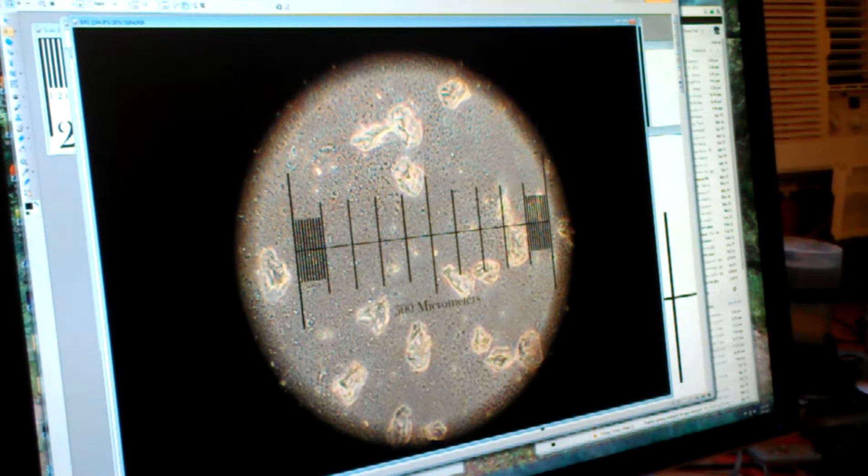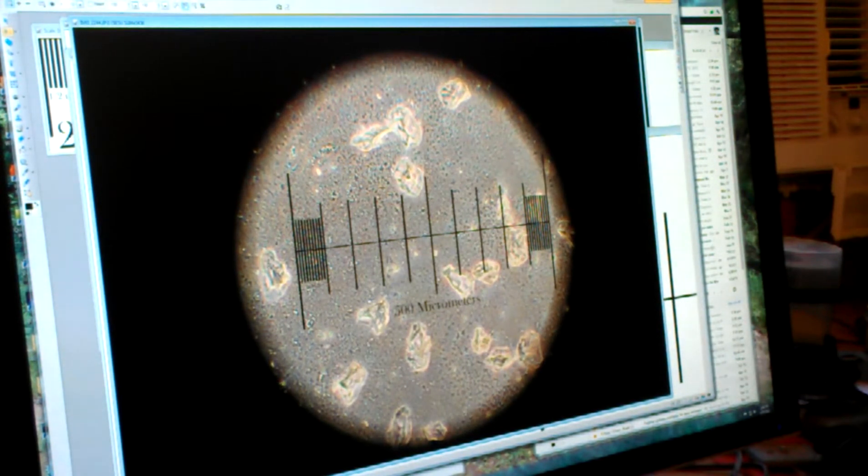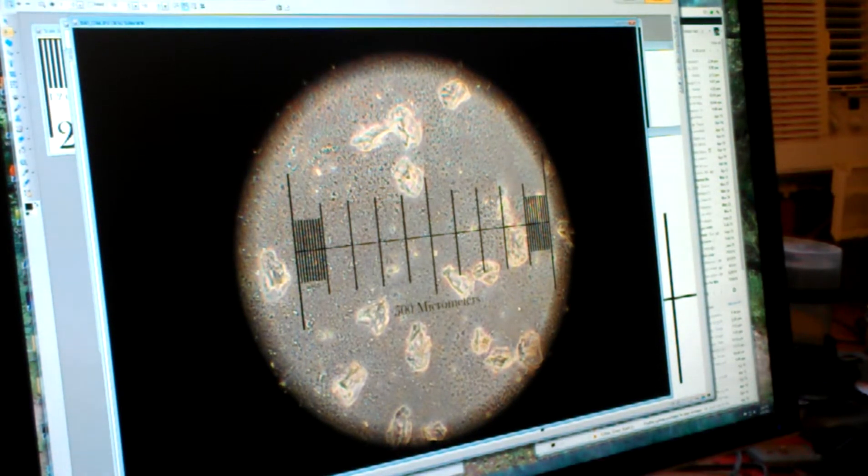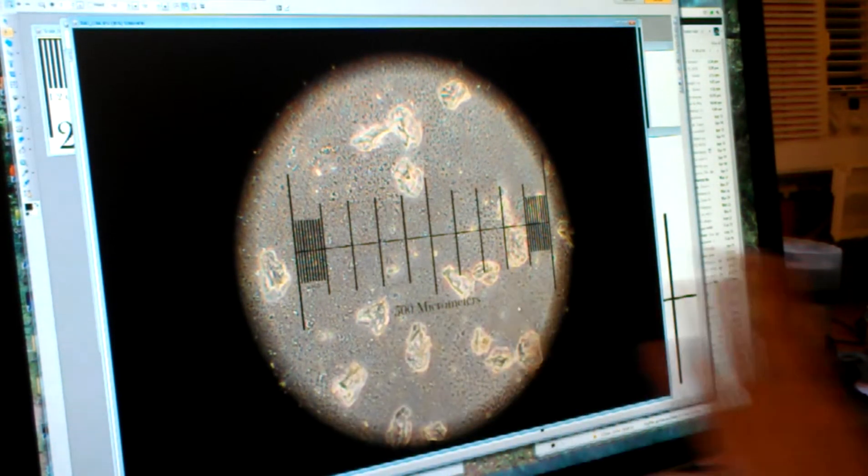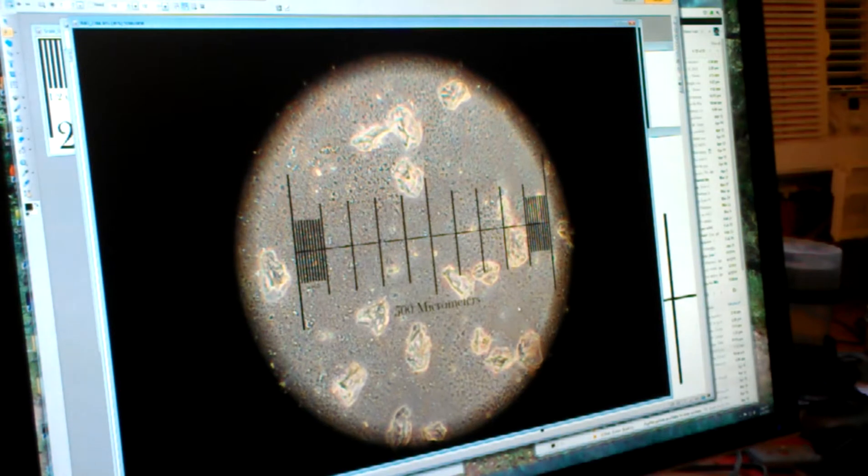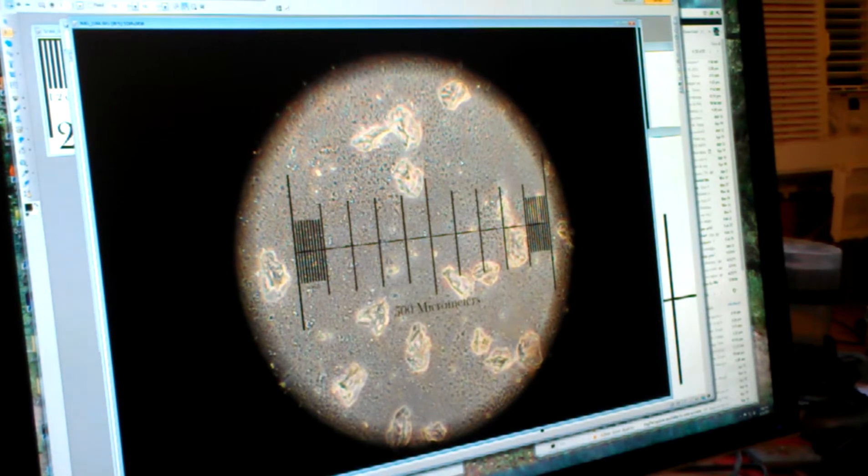Now this slide is just dried. That's why we've got all of this noise around here. These are little bits of dried spit, basically. When we put a mounting medium like water or a kind of glue over this to glue a cover slip on, then those will basically disappear because they'll be the same refractive index.